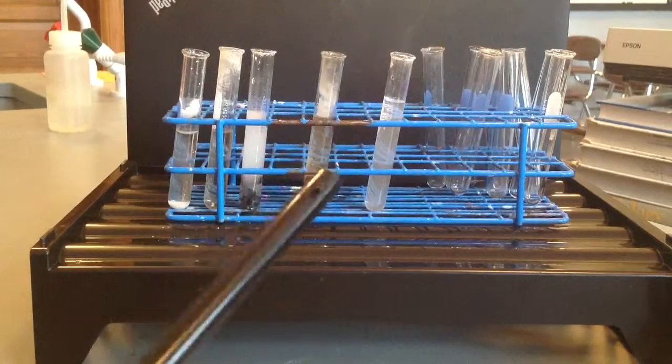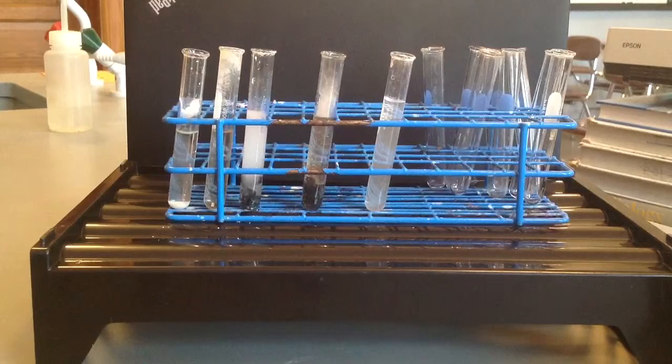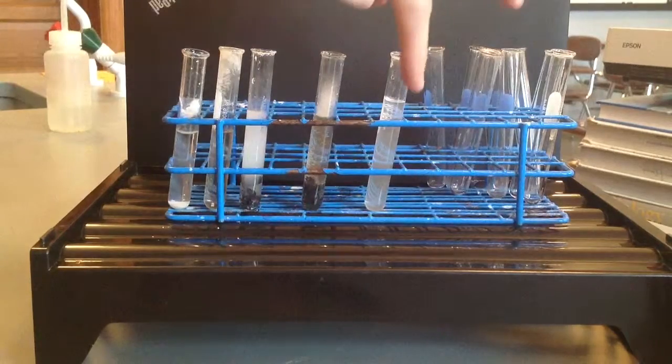Okay, again, I don't know if you could hear it. It was really, really quiet. There was just a very soft pop sound, almost like a poof. Okay, so over here we have our silver nitrate.